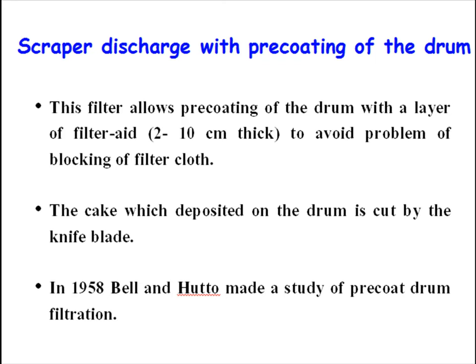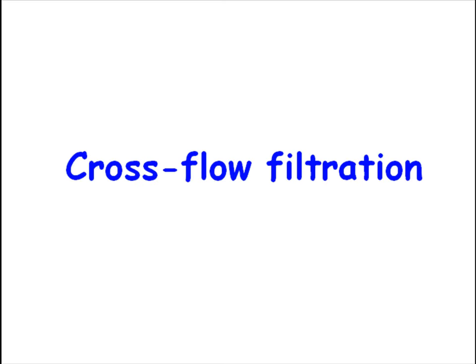The cake deposited on the drum is cut by a knife blade. In 1958, Bell and Hutto made a study of pre-coat drum filtration. Now last, that is cross flow filtration.